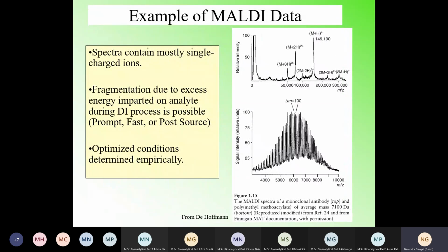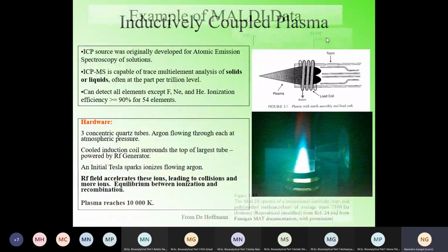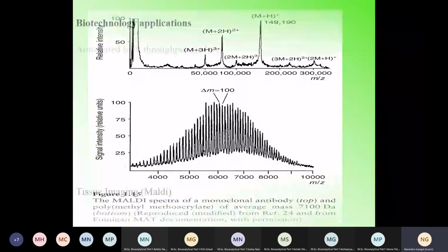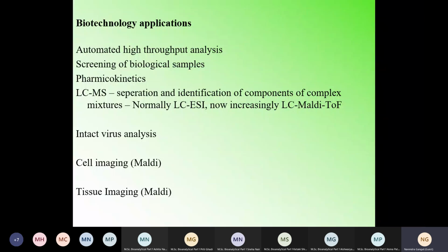So the same thing which I have shown you. Now we have studied MALDI and its features also. It's a very useful technique for biotechnological applications, and it is used a lot only for advanced research, not for simple pesticide or other agrochemicals or simple molecule research. MALDI is not a technique for that. It is used for very advanced biotechnological applications. So we have seen the brief fundamentals, the application parts and how it is used.